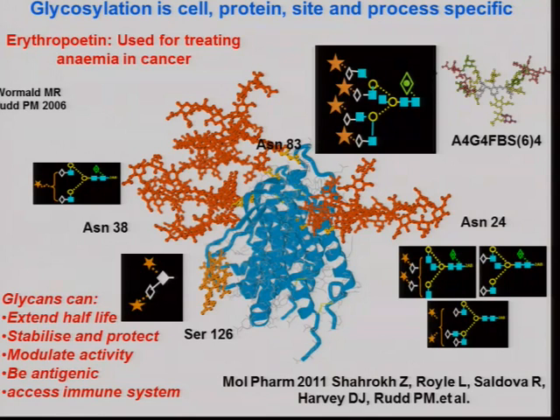That's why with the LC you can often get peaks that you don't see on the mass spec. Until this new label came along, and we haven't really tested it very thoroughly yet, you would see small peaks on the LC because the signal to noise is huge, and you can go down into the baseline and still have very good signal to noise, so you can be confident about very small peaks. But it's a kind of judgment whether you need to know all those small peaks. If you don't, you need to point out in your report that you saw these peaks and didn't further analyse them, because they might be important. Small levels of an antigenic peptide can be very important in some people who are hypersensitive.